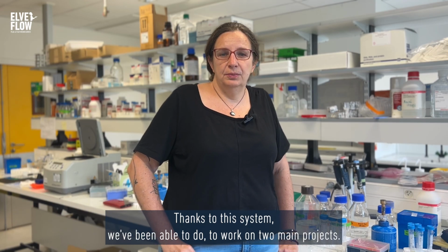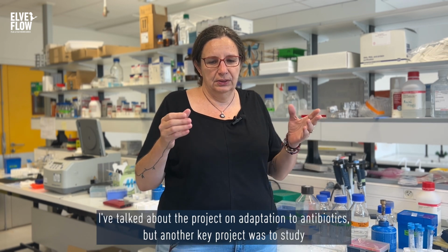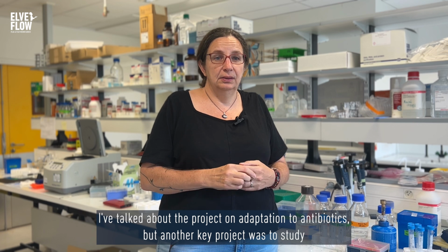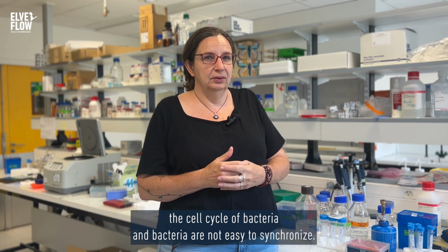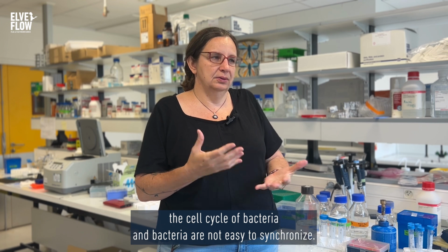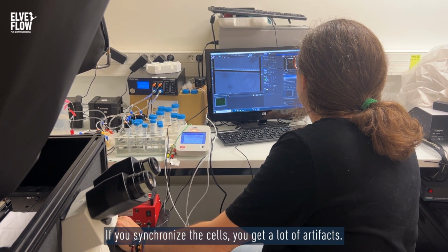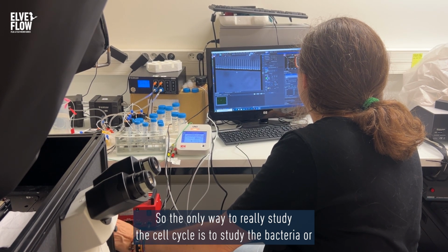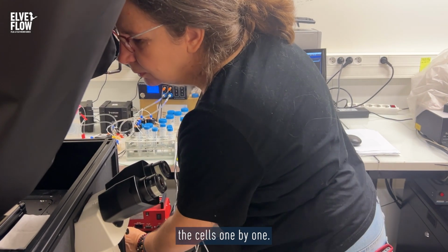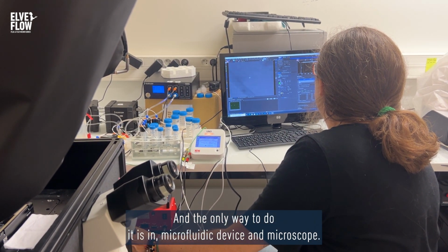Thanks to this system, we've been able to work on 2 main projects. I've talked about the project on adaptation to antibiotics, but another key project was to study the cell cycle of bacteria. And bacteria are not easy to synchronize. If you synchronize the cells, you get a lot of artifacts. So the only way to really study the cell cycle is to study the cells one by one. And the only way to do it is in a microfluidic device, with a microscope.